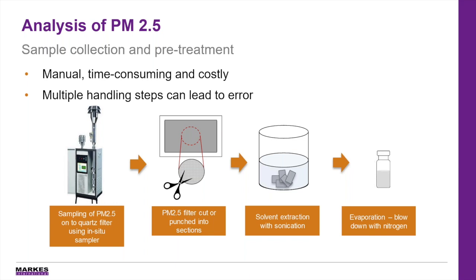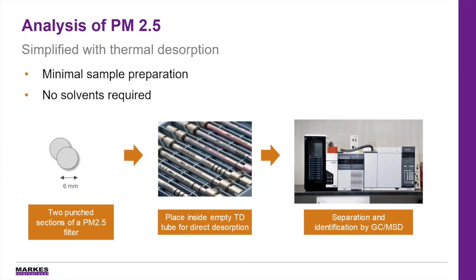Now, this is quite a manual process. It's also very time consuming and costly because you have to use a lot of solvent and you have to therefore dispose of a lot of solvent waste. And on top of that, the multiple handling steps can lead to errors. Now, with thermal desorption, this process is massively simplified.